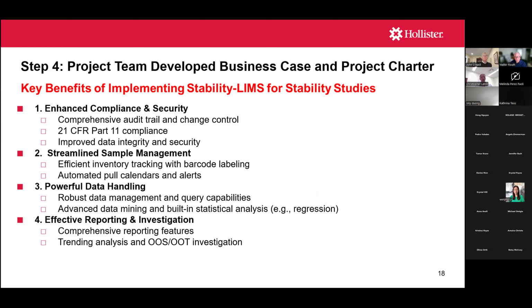Again, besides our Word document reports that we were doing, we wanted the ability to generate a variety of different reports, have viewable pull calendars, trend analysis, and then also, in the event that we had an out of spec or out of trend result, we wanted the ability to perform that investigation directly in the software itself.